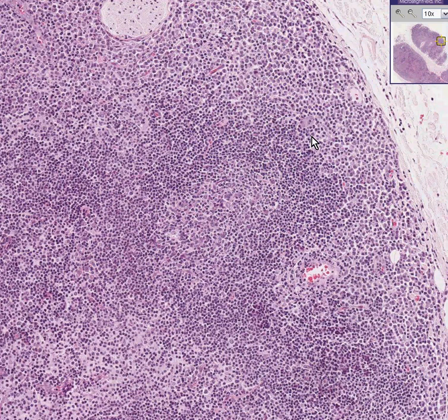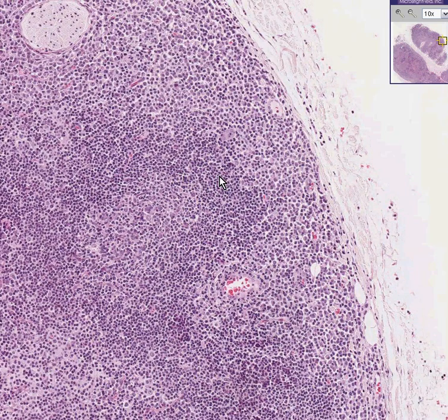And then out at the periphery — and remember, I'm not showing you morphologic differences, these are often only seen through stains — at the periphery you will then get some T cells. This lymphoma is called a B cell marginal zone lymphoma.